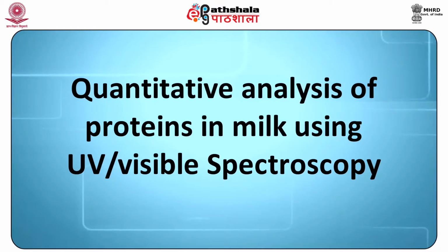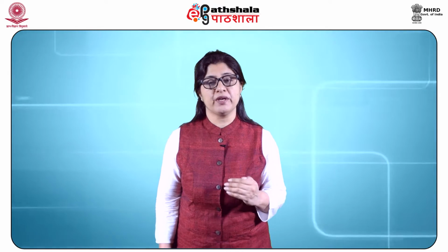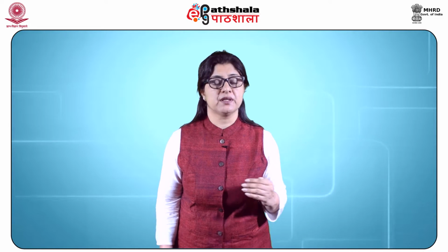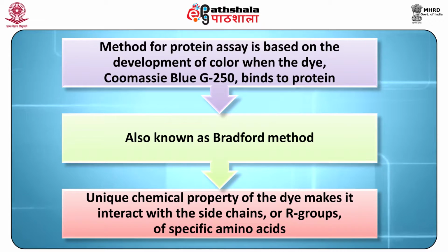Quantitative analysis of proteins in milk using UV visible spectroscopy. The quantitative analysis of proteins can be carried out with UV visible spectroscopy by measurement of wavelength of absorbance in protein assay and using the Beer-Lambert law. This law states that when a solute absorbs light of a particular wavelength, the absorbance is directly proportional to the concentration of the substance in solution. This method of protein assay is based on the development of color with a dye.